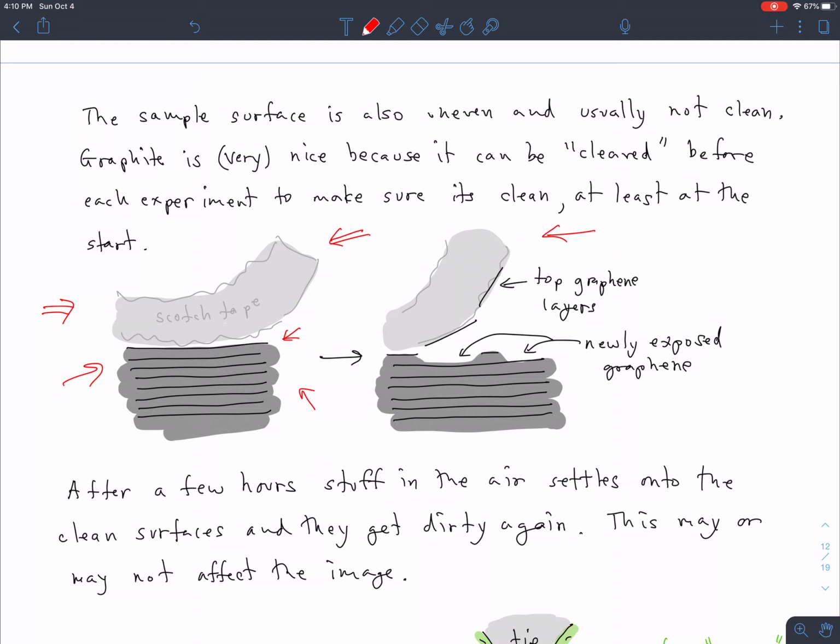You've got a completely new layer that's just recently been unburied. You've what's called cleaved the crystal, and that leaves behind a nice clean surface with maybe some step defects or other kinds of defects. And you can see all that. You can see the atoms when you're looking in between the defects, and you can see the defects when you widen out the scan area.